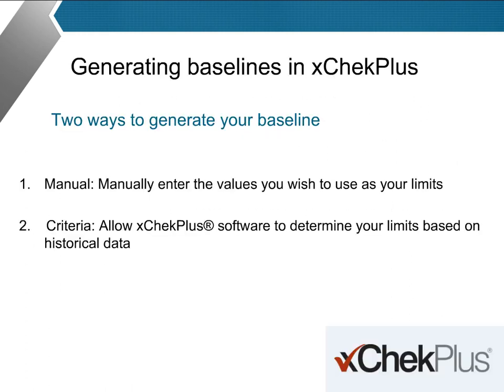So let's begin by walking through the baseline setup in the new XCheck Plus software. There are two ways to generate your data. The first, manual, means that you actually enter the manual values you wish to use as your limits, and these are typically determined between the lab and the people interpreting the information. The second, criteria, allows you to use XCheck Plus software to determine your limits based on historic data that you've generated on other flocks.